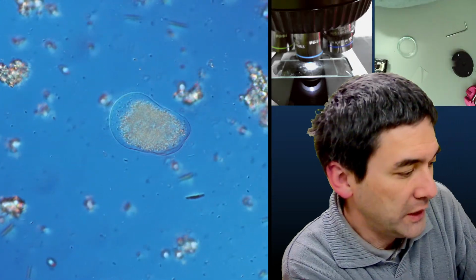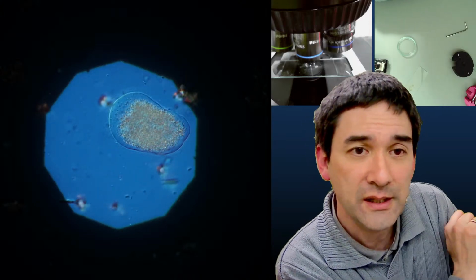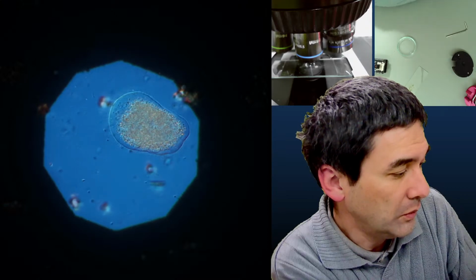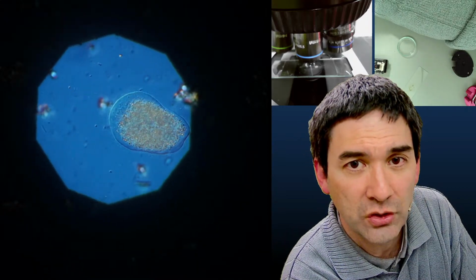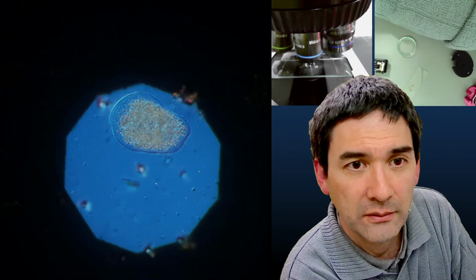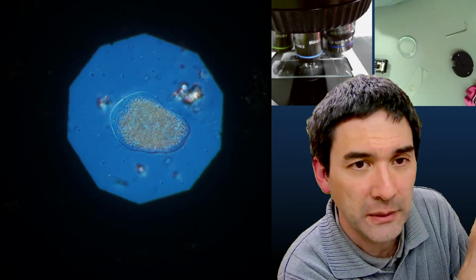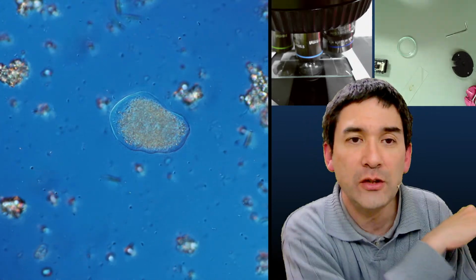And Köhler illumination is the following. Let me see if I'm able to show this to you. You see this here? This is the Köhler diaphragm. What I can do for calibration is I have 2 screws there that I can turn so that I can move it into the center. And then once it's set up like this, I open it just enough so that I do not see the edges of the diaphragm.